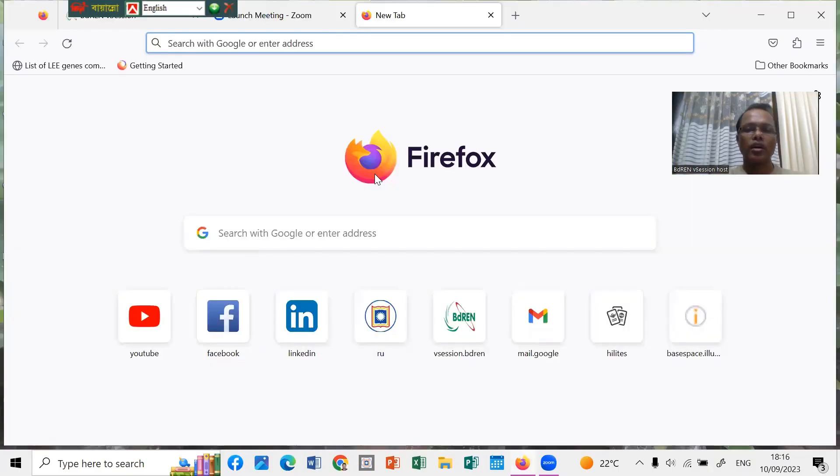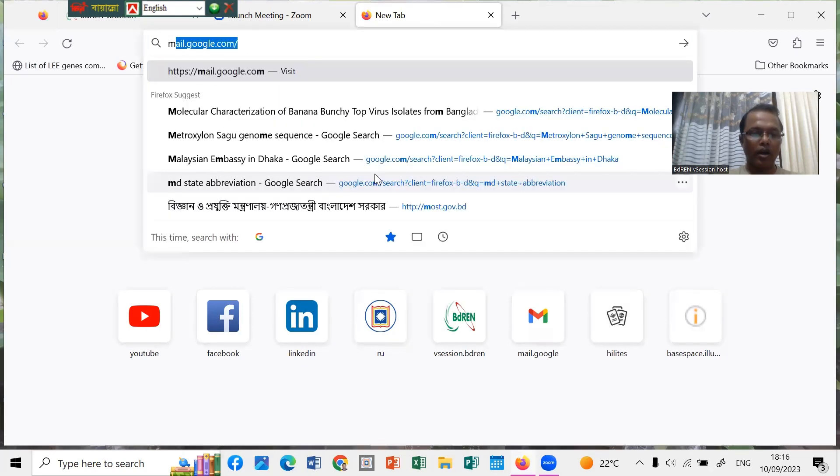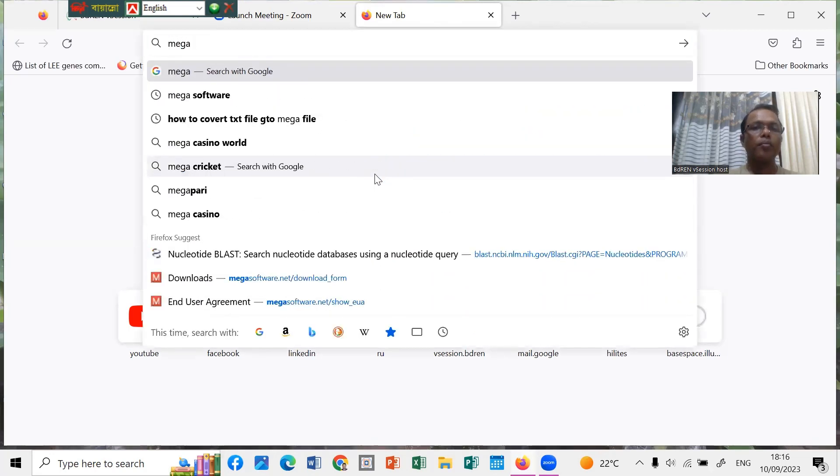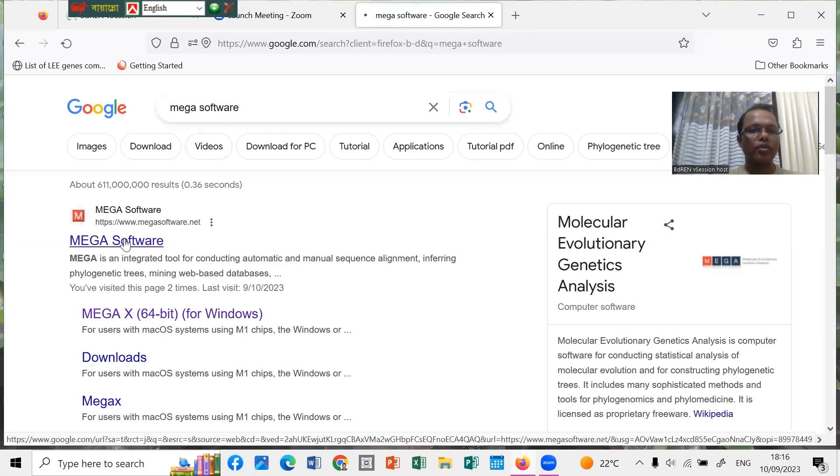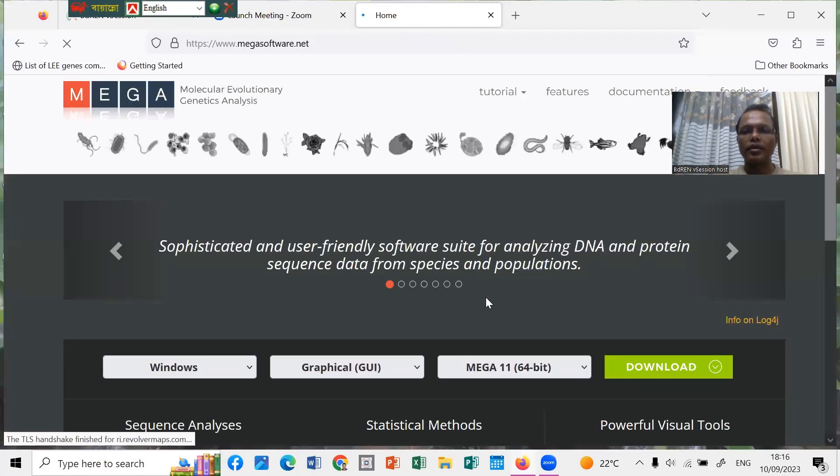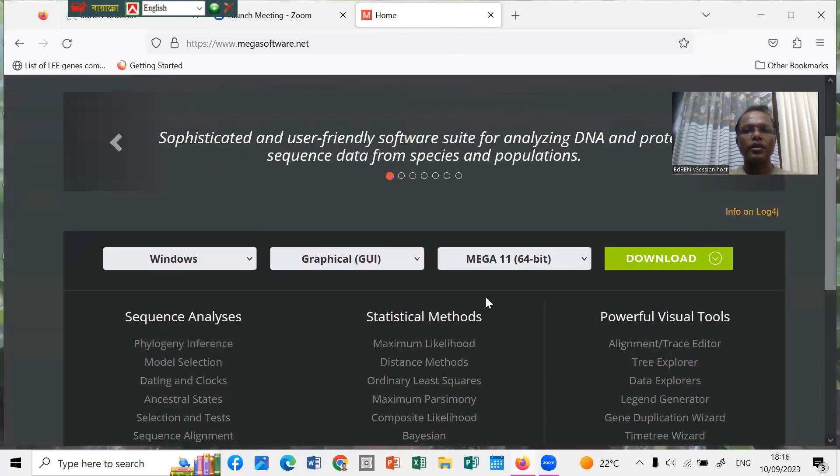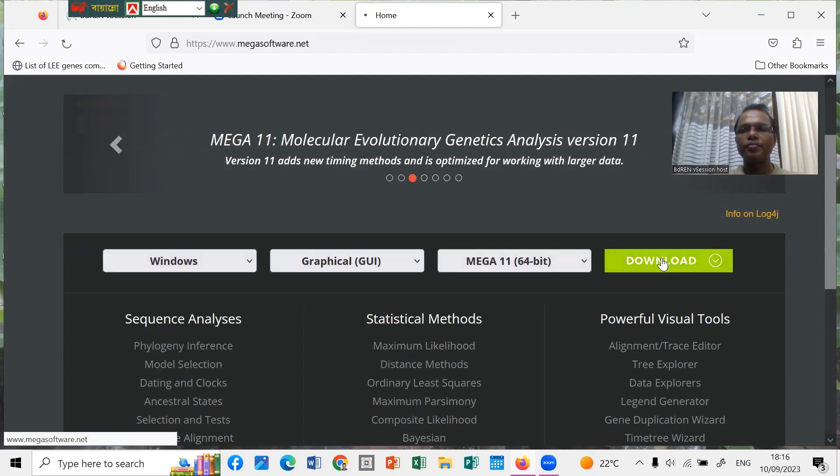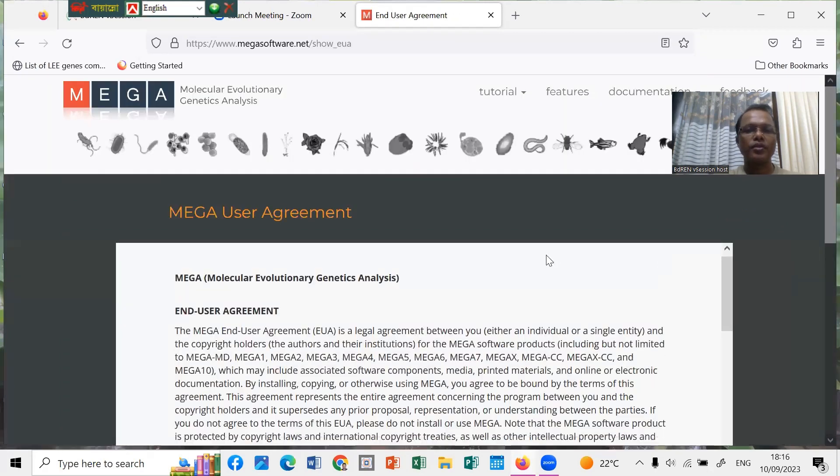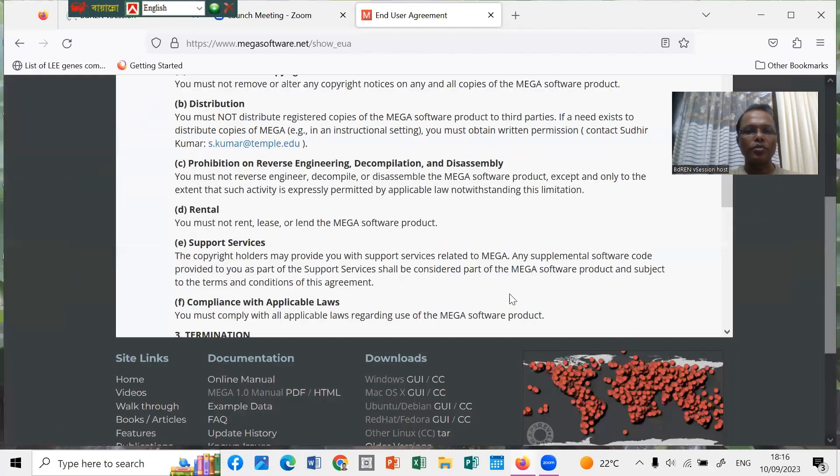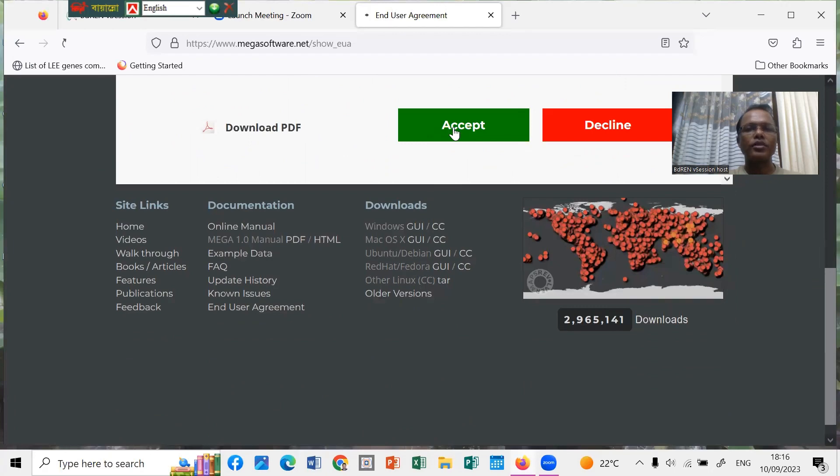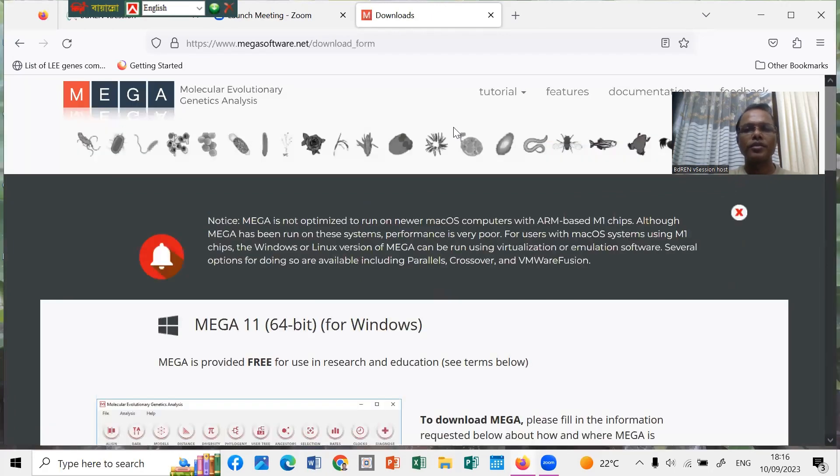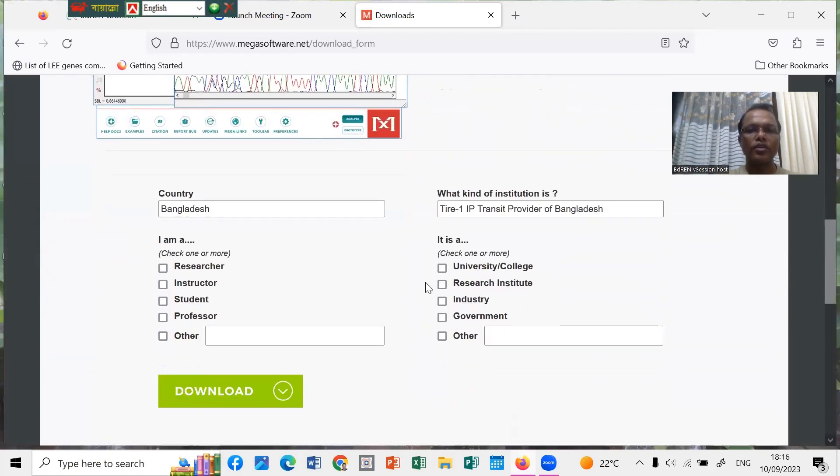Let's start to download the MEGA 11 software from the website. You can search in Google for MEGA 11 software. This is the MEGA software for Windows. You have to download from here for Windows. For downloading the software, you have to accept their terms and conditions, then accept the customs and conditions.